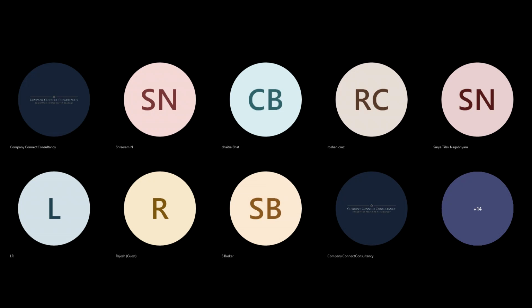It's not just creating the users. While creating the users, how the roles are created, which user has which role, why the need for roles is there, what the different flags are while creating users. We'll try to touch that. Sample, how to create samples, sample template, lot. So in the later courses, we'll slowly touch one topic at a time.